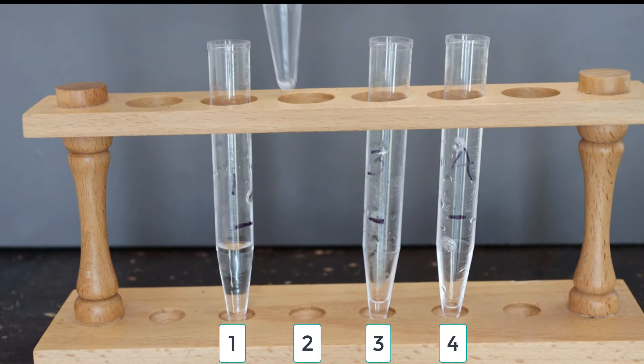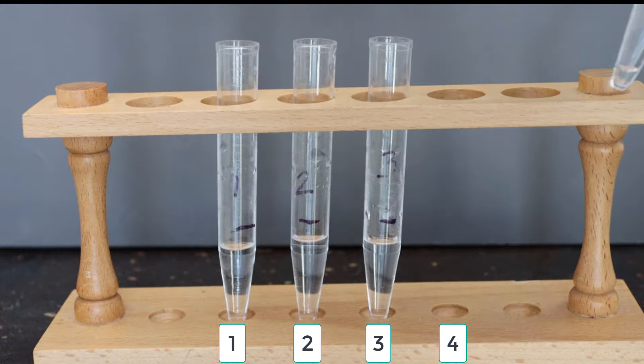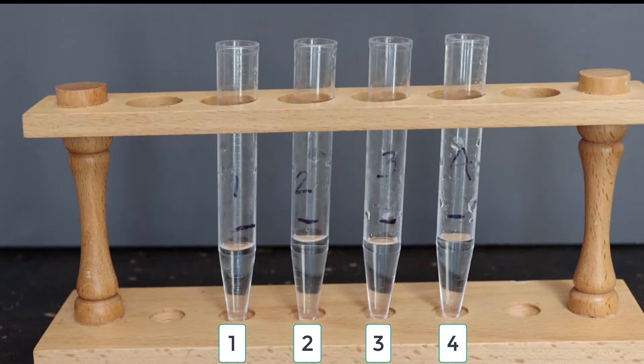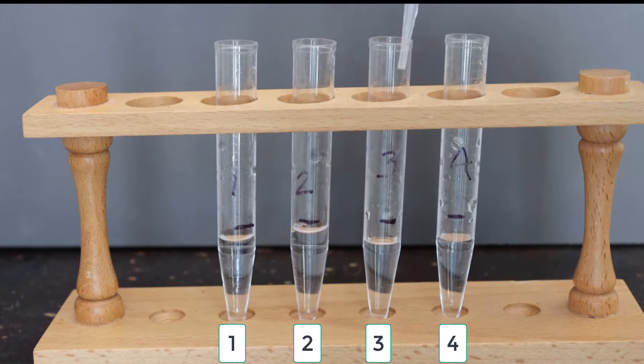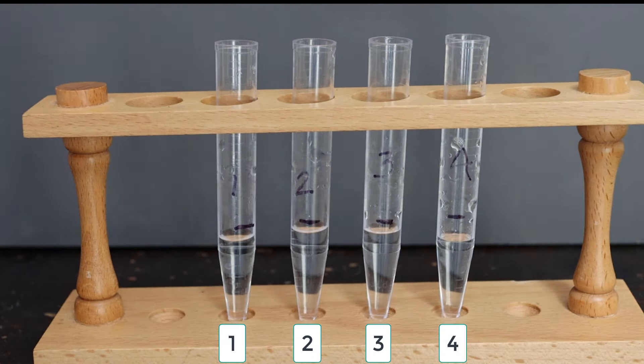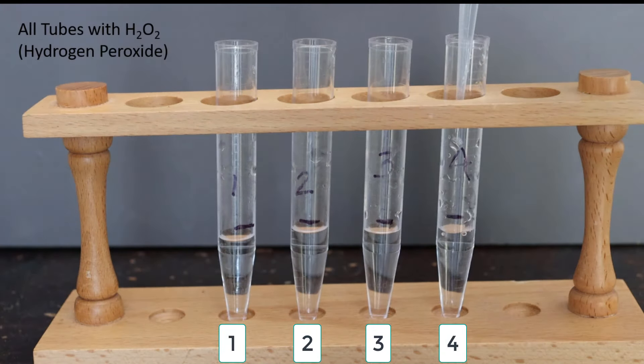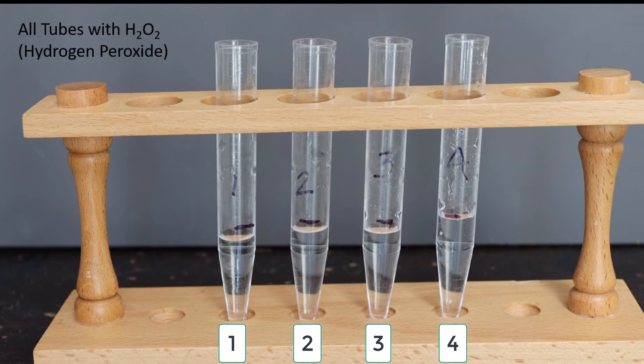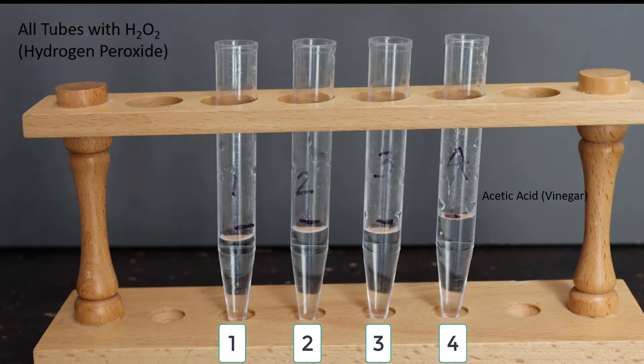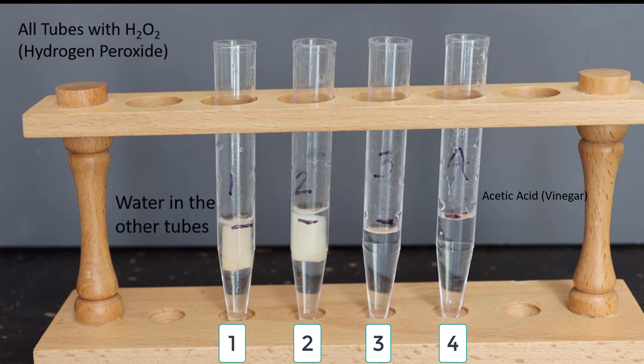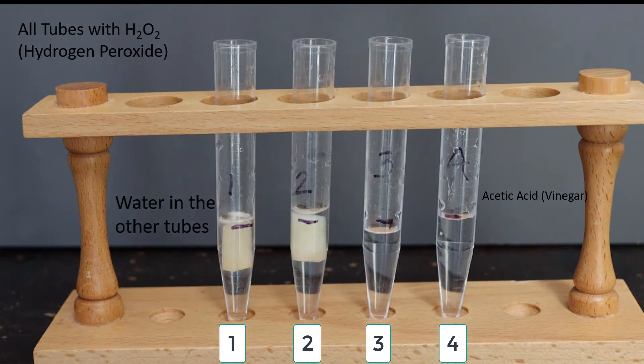Then we set up our test tubes. We have four test tubes—one, two, three, and four—that will correspond to our potatoes. The liquid inside the test tubes is hydrogen peroxide. And then in test tube four we also put one milliliter of acetic acid or vinegar, and we put one milliliter of water in test tubes one, two, and three.